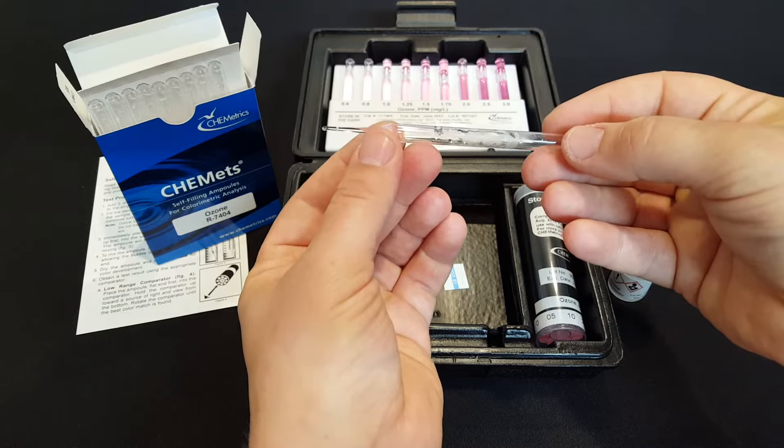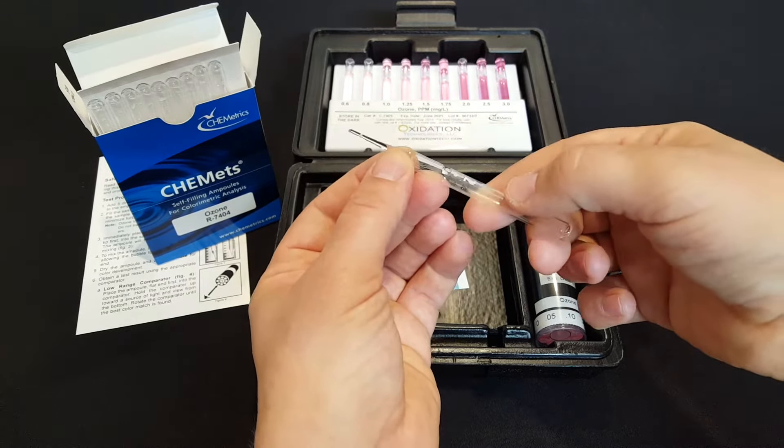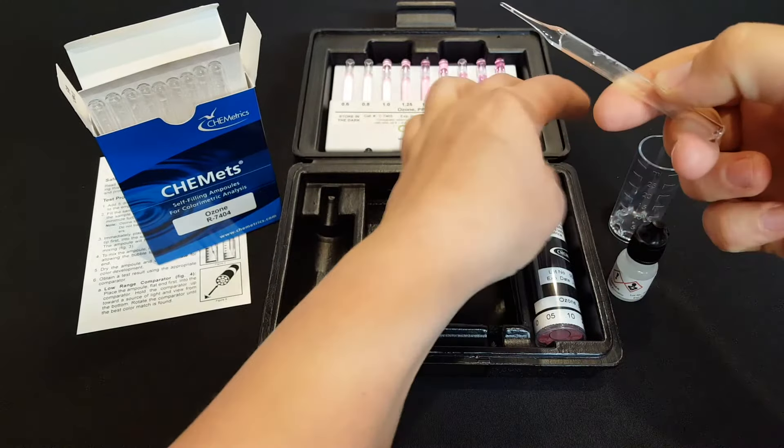For example, if you have low levels of dissolved ozone the color will be very light. If you have more ozone in the water the color will become a darker pink.